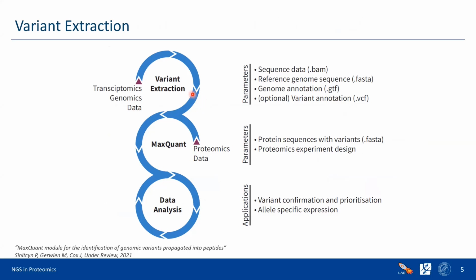But if we stop on that and start making conclusions out of the mutations, the variants which we found, maybe it would not be sufficient. But the thing is that we can allow so many false positives because we are filtering all these variants through the proteomics later. And we're doing this using MaxQuant.